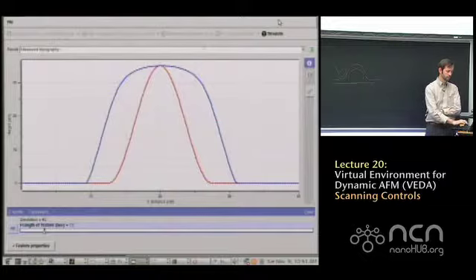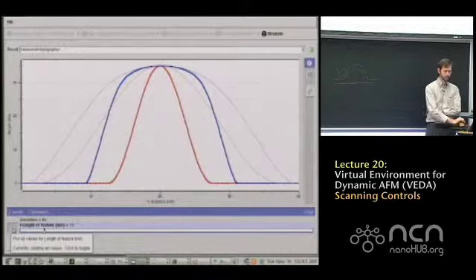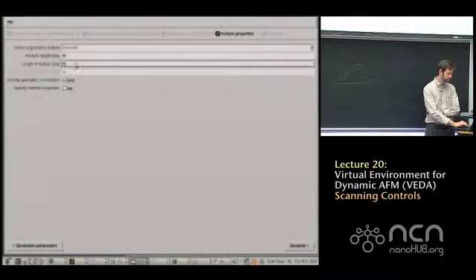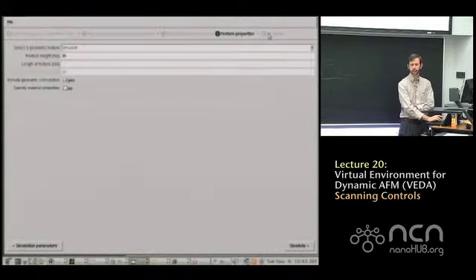So this actually is a little bit worse. So now I can hit this all button over here, and I can compare my two simulations. And whereas before it still kind of looked like a sinusoid, now it's looking less like a sinusoid. This error right here is more and more. And now I'm going to go back and I'm going to make this feature very small. So I'm going to make it 1 nanometer. So that's actually smaller than my tip radius.